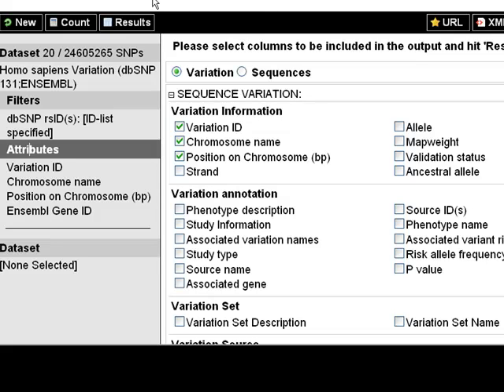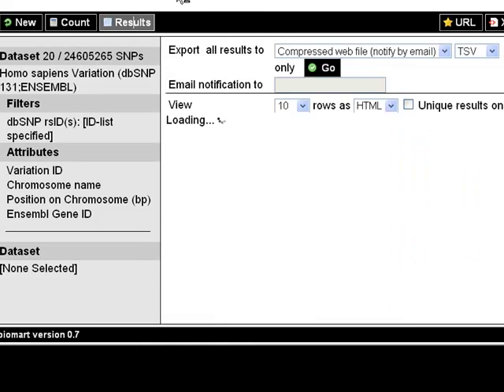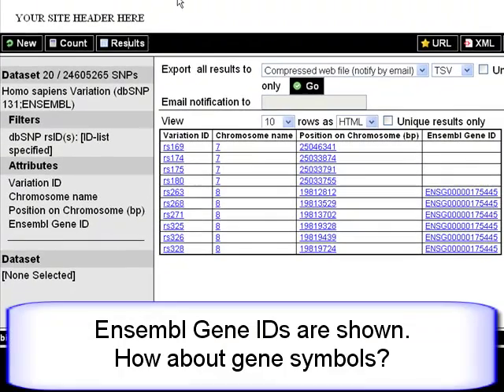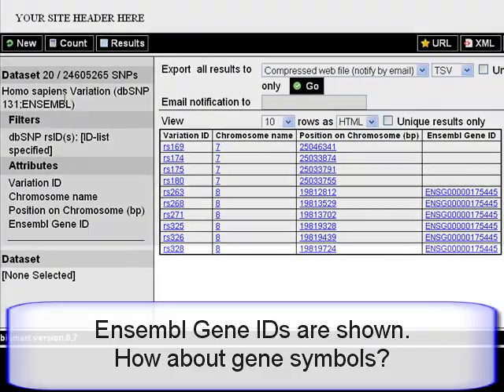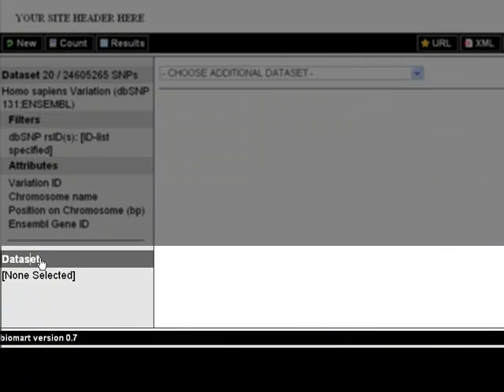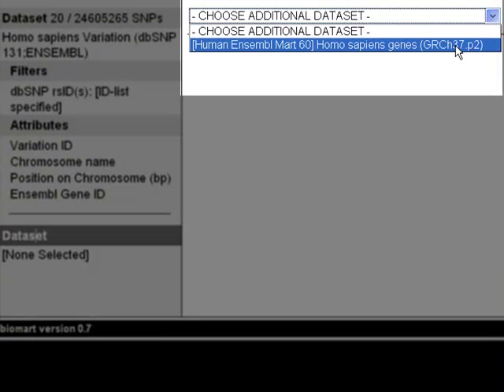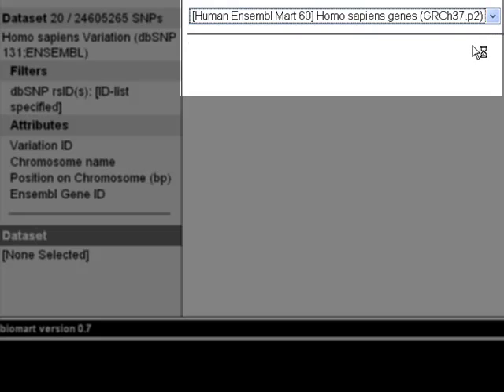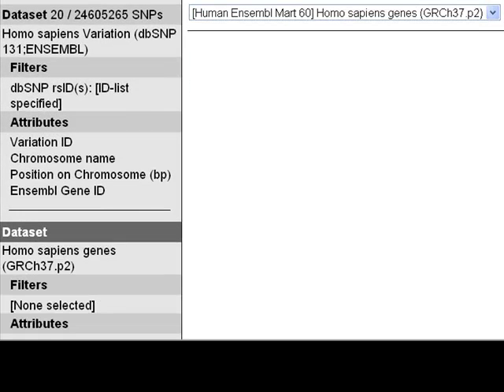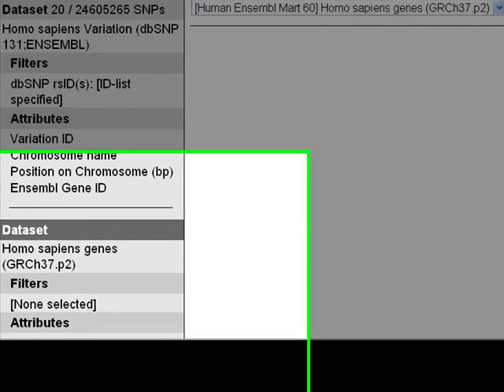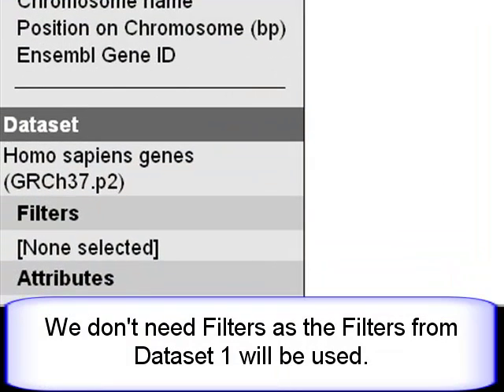Click Results for a preview table. To see gene names and HGNC symbols for human, I have to use a second dataset. My additional dataset will be Homo sapiens genes. Filters and attributes are added across both datasets.